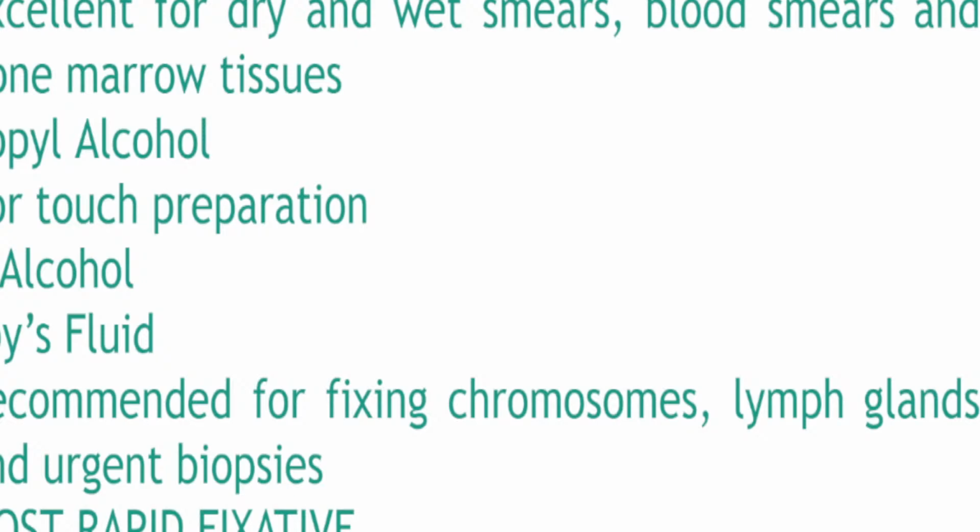What else? Carnoy's fluid is important because it's usually still used for chromosomal studies, lymph glands, and urgent biopsies. Urgent biopsies, what is that, sir? I thought we only use frozen sections. We also have urgent biopsies because sometimes you need less than 24 hours to fix a sample.